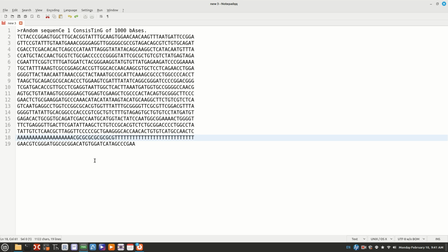Okay, let's see, a few more A's than T's. Let's go ahead and reduce this by about 3, and put 3 more A's in there. Or maybe that looks about right. Or about even amounts with some C's and G's in between. Maybe let's make it a little more. Let me take out 2 T's and 2 A's, and let's add some more C's and G's in there.